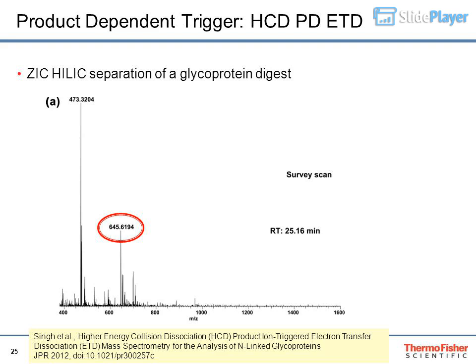The ETD mass spectrum provides peptide sequence information, which is unobtainable from HCD. Full FTMS scan, m/z 380-1600, and subsequent HCD-MS/MS scans of the 40 most abundant ions above an absolute signal intensity threshold of 500 counts.